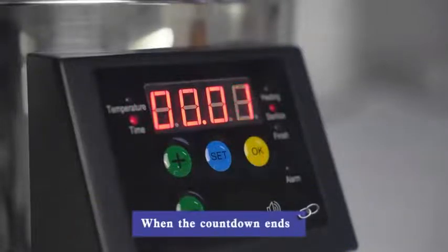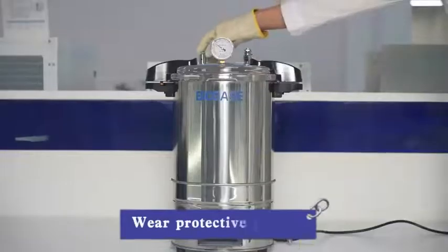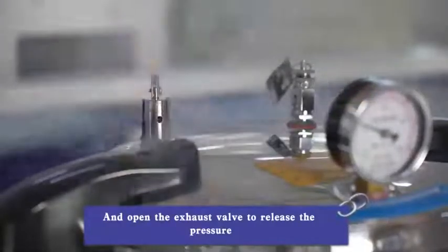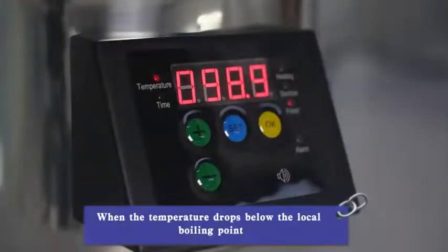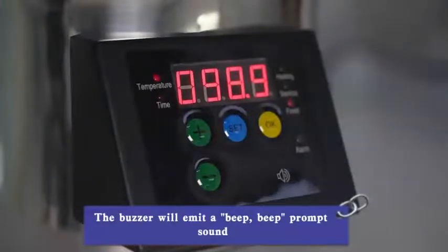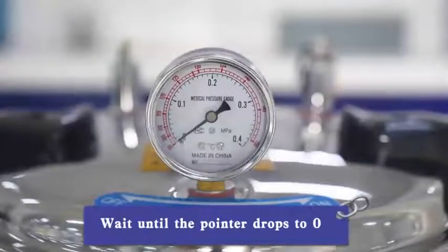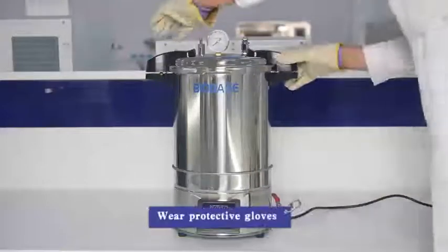When the countdown ends, the buzzer will emit a beep prompt sound. Wear protective gloves and open the exhaust valve to release the pressure. When the temperature drops below the local boiling point, the buzzer will emit a beep prompt sound. Observe the temperature gauge and wait until the pointer drops to zero. Turn off the power.